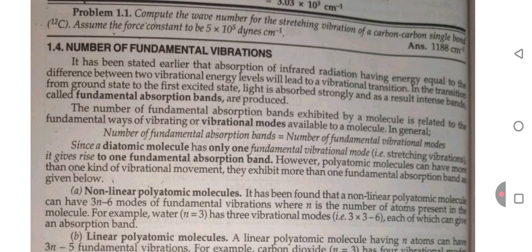Number of fundamental vibrations. It has been stated earlier that absorption of infrared radiation having energy equal to the difference between two vibration energy levels will lead to a vibrational transition. In the transition from the ground state to the first excited state, light is absorbed strongly, and as a result, intense bands called fundamental absorption bands are produced. The number of fundamental absorption bands exhibited by a molecule is related to the fundamental ways of vibration, or vibrational modes, available to a molecule. In general, the number of fundamental absorption bands is equal to the number of fundamental vibrational modes. Since a diatomic molecule has only one fundamental vibration mode, it will give rise to one fundamental absorption band. However, a polyatomic molecule can have more than one kind of vibrational movement. They exhibit more than one fundamental absorption band as given below.